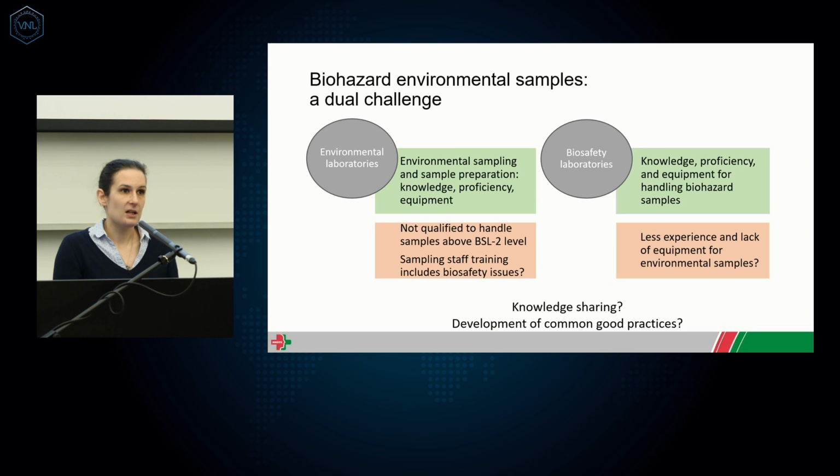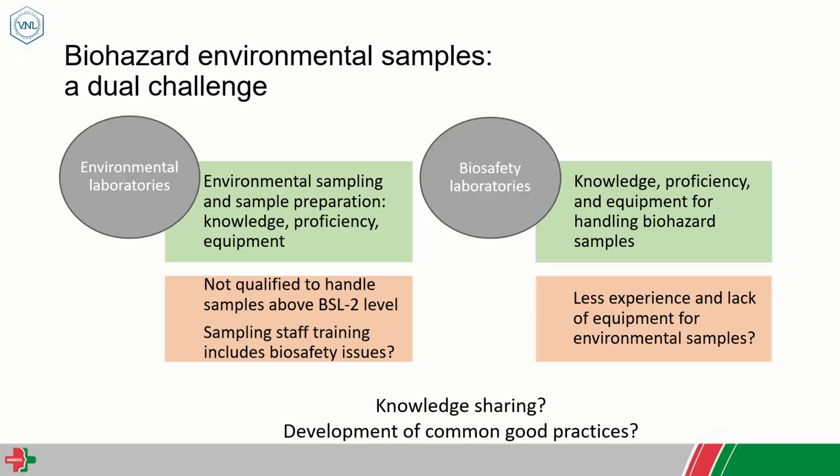We have the knowledge, the proficiency, and the equipment designed for the sampling and the sample preparation for environmental samples. However, usually environmental laboratories are not qualified to handle samples above BSL-2 level.